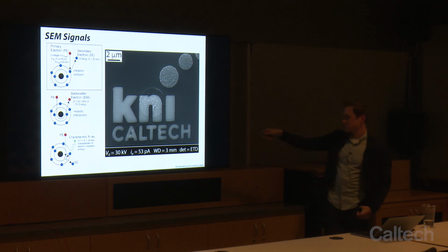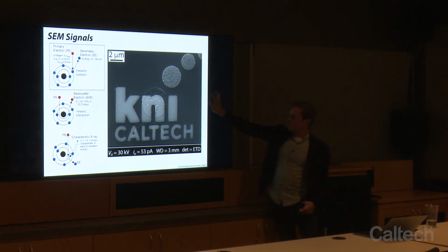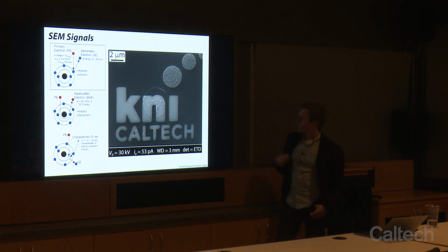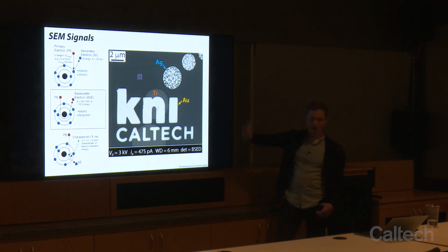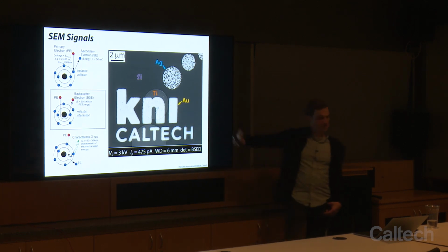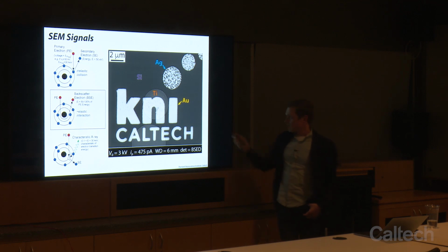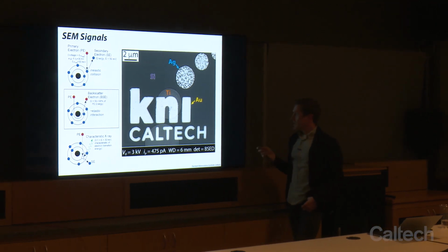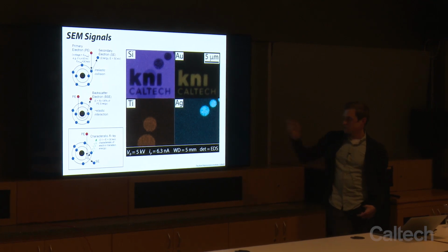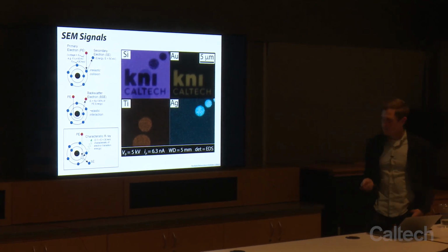All right, so just showing these in larger magnification. Here you can see a secondary electron image. You see all the topography, all these imperfections. When we go to the backscatter image, the image flattens out a little bit. You can still see some of this, but it's much flatter, I would say, but better Z contrast. And in our EDS maps, we can see the elemental contrast.